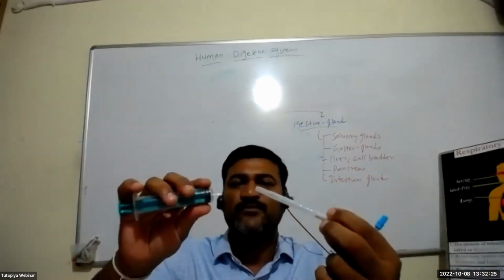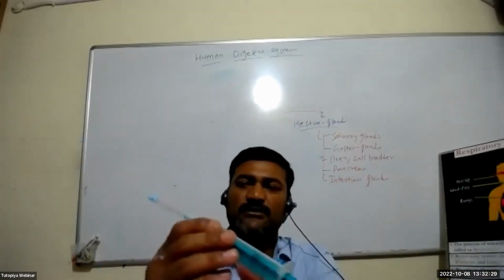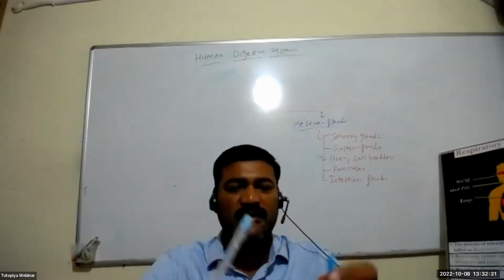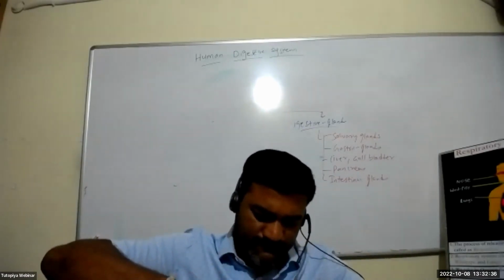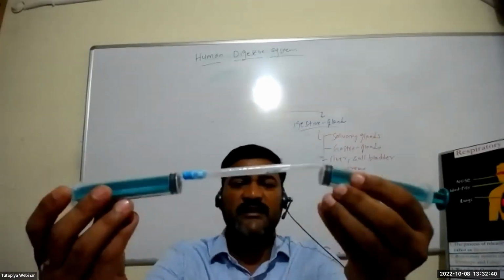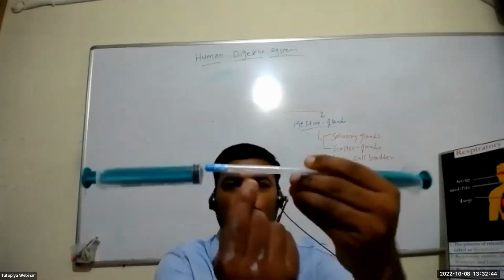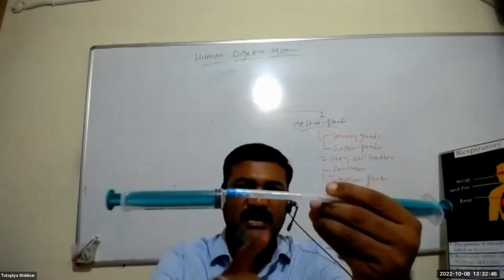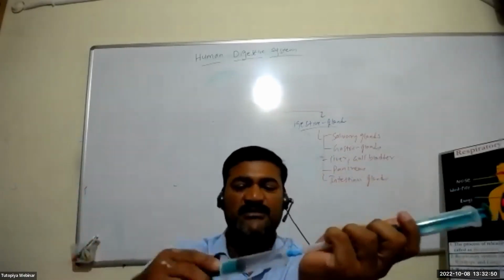Now connect one end with a syringe, and the other end also you connect it with another syringe, like this. Okay. Now, after connecting it, what you do is heat this copper from the bottom, and as you start heating, start pulling and pushing this syringe.